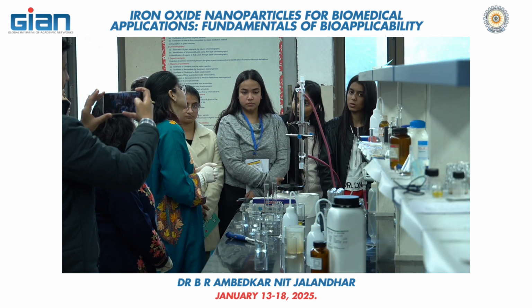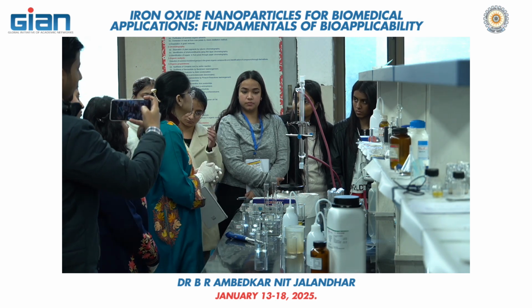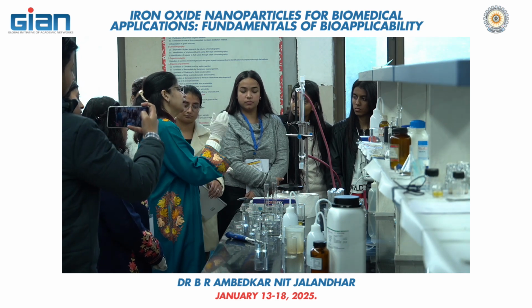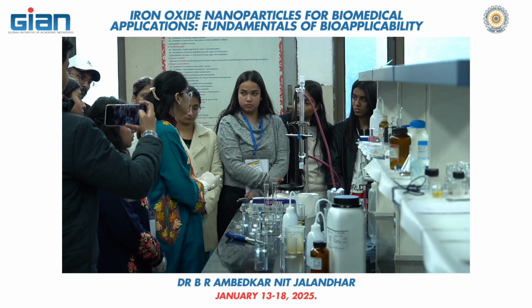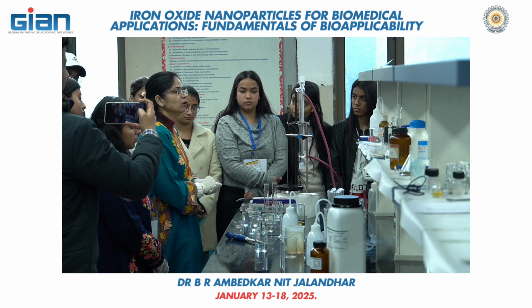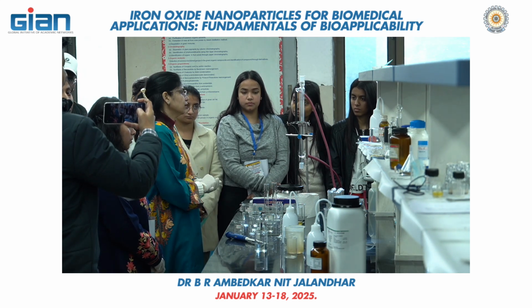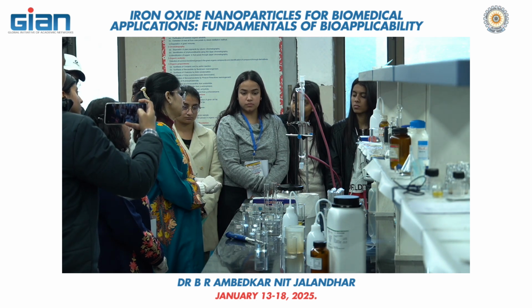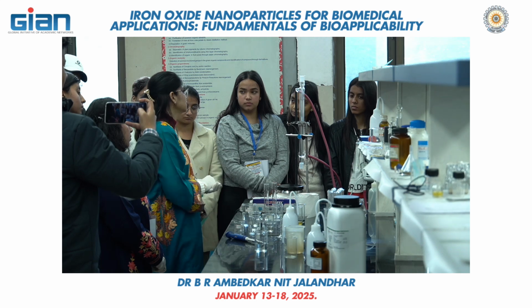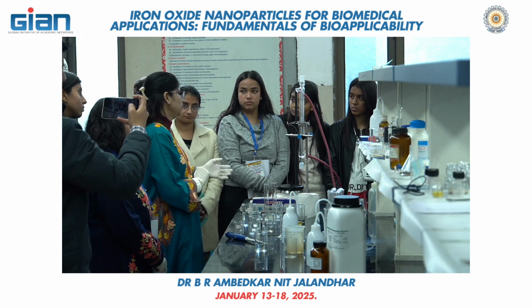You can use this suspension in nanocomposite synthesis also. You can add bulk material to these nanomaterials to convert them into nanocomposites. You can have different applications like photocatalysis, sensing, and as a catalyst also.